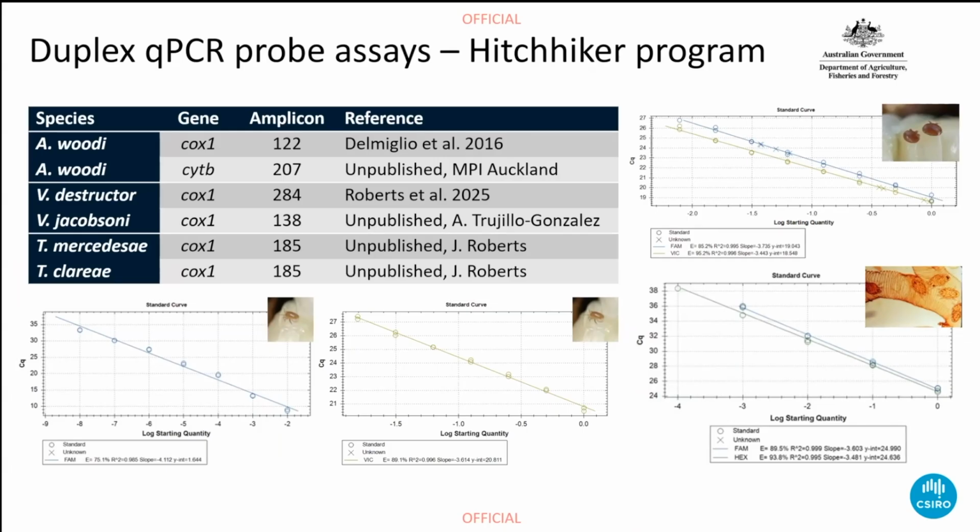And so this first step, which is based in the lab, it's really about making sure that these genetic tests are both species specific so that they have a low chance of false positives, but we also want them to be highly sensitive so that we reduce our chance of getting false negatives. We've done this lab work. We've been happy with how they're performing in the lab.